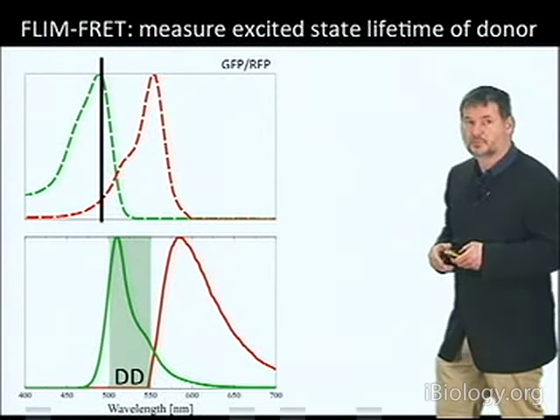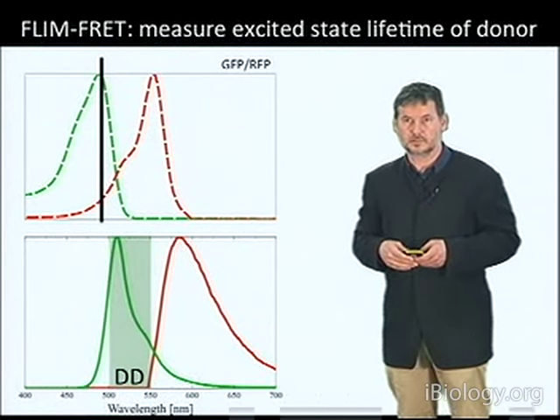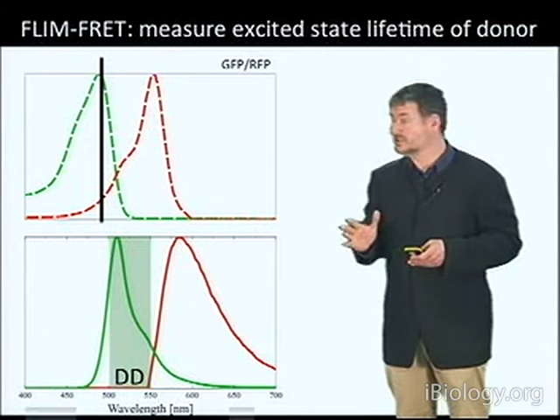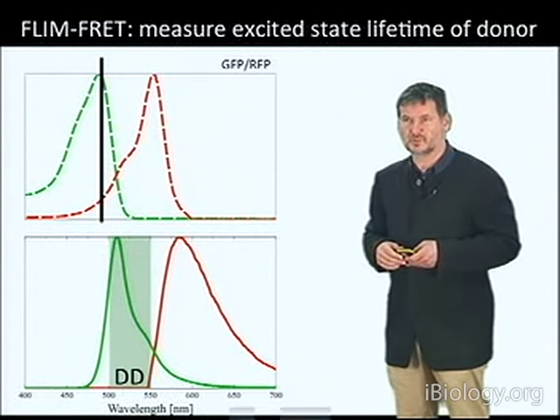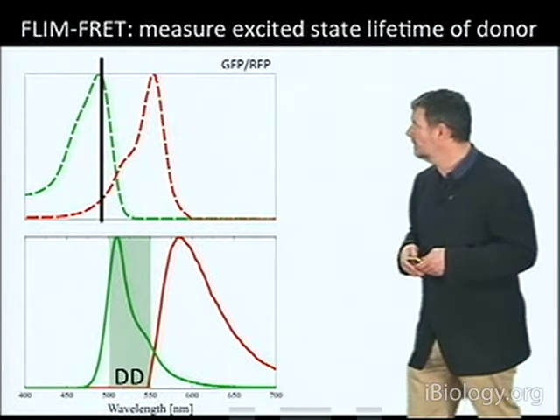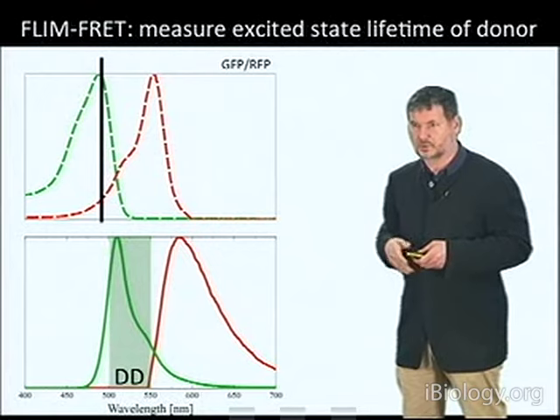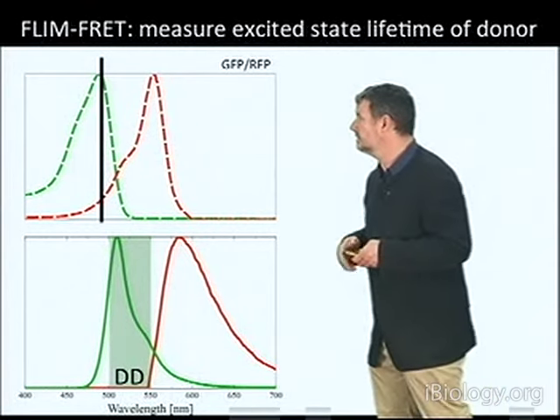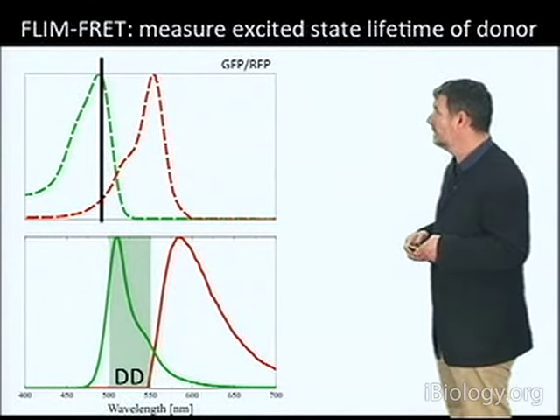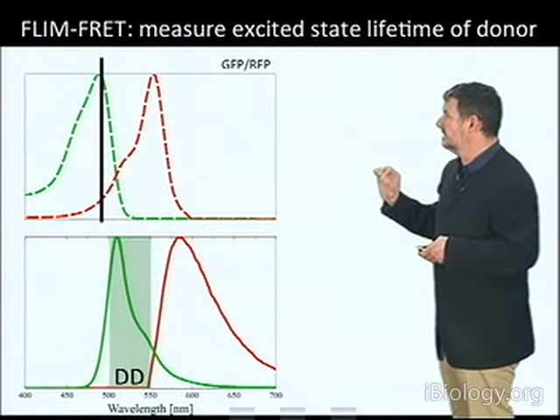So this is the last approach I'm going to describe, and I'm going to elaborate more on it in the second seminar, which deals specifically with it, because it's the most quantitative approach, but also involves a little bit more elaborate equipment, and also elaborate analysis methods, and it's worth discussing it separately. The major strength is really quantification.